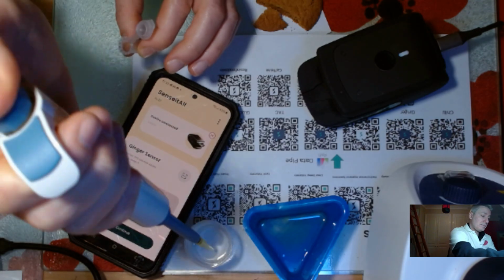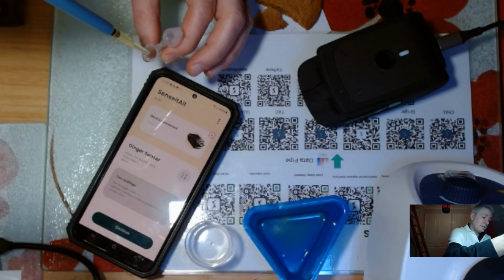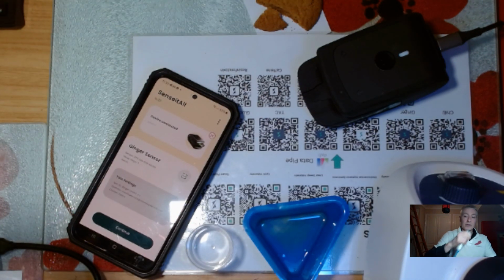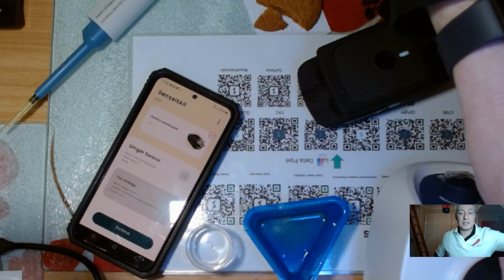1, 2, 3, and 4. Right, 400 microliters plus 100 milligrams. This is what it looks like. This is the power of the kind of science that we do.